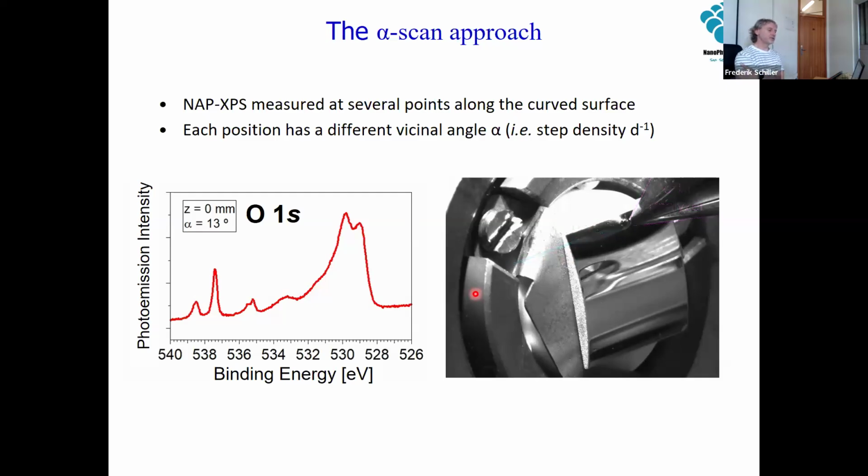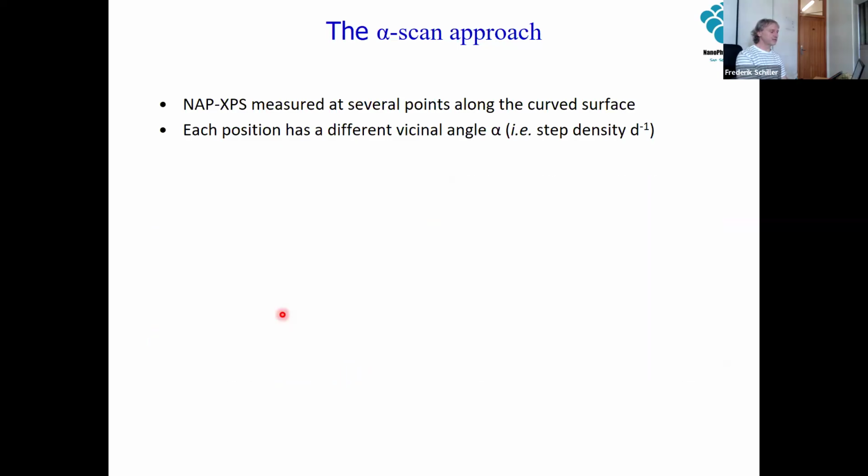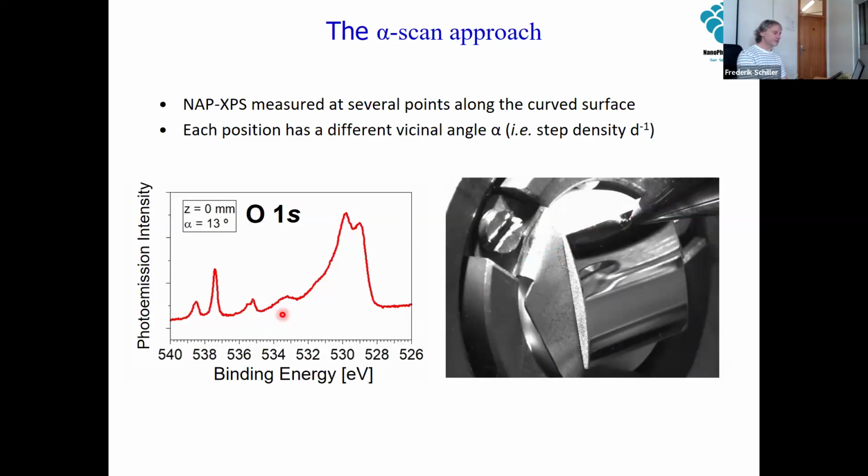So basically what we do, we move up our crystal and we take the spectrum corresponding to that, and then you see for each part of the crystal, we will have a different spectrum that we can address. And out of these different spectra, then we can make for each point, so we measure here, we measure there, next, next, next, next, next.